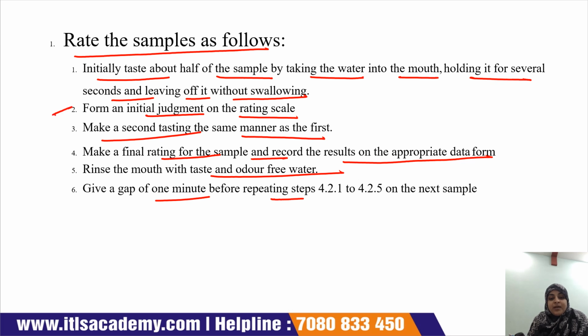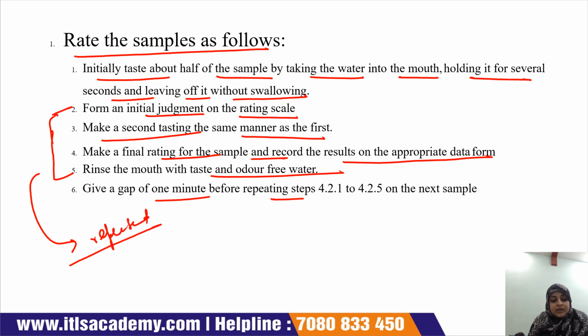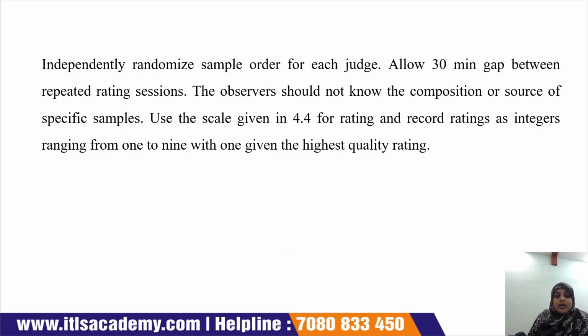This step should be repeated, but when we repeat it, we have to wait at least 1 minute so that the taste of the previous sample goes off.